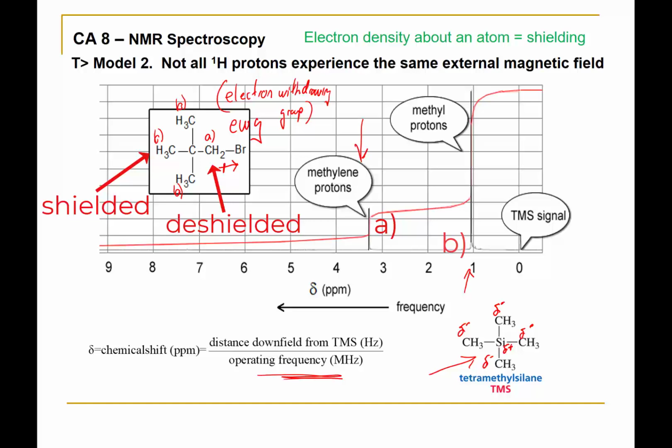The environment around those methyl groups, therefore, has a large electron density. So we'd say those methyl groups are extremely shielded. And therefore, it makes sense that we'll set that to be our zero radio frequency. There are very few organic structures that would have a more shielded environment. And so compared to that, our other methyl groups, which are shown right here, are somewhat de-shielded because they're not bonded to something that is even less electronegative. So in this particular spectrum, you can see that it's relatively simple and it corresponds to two distinct environments.